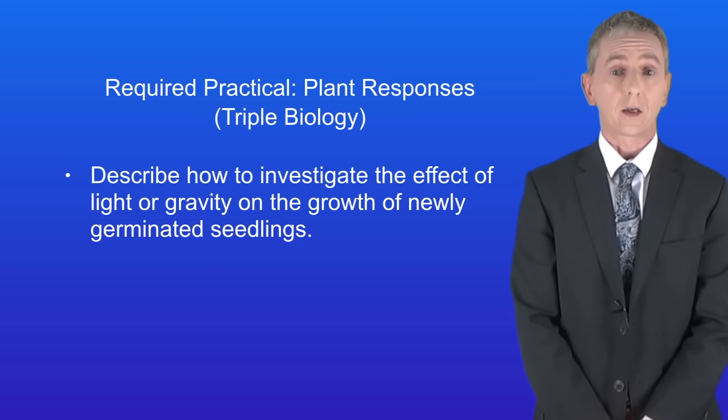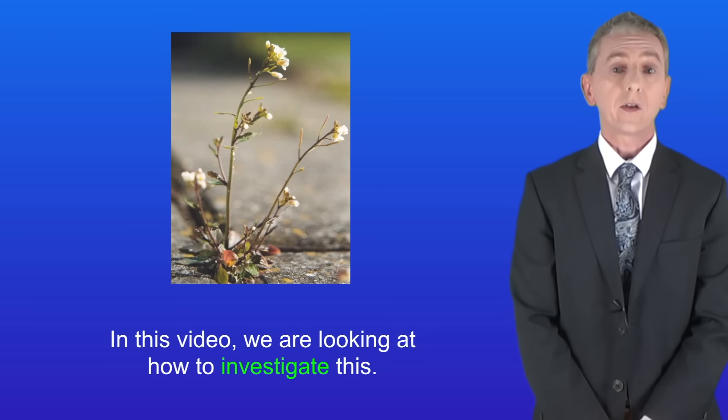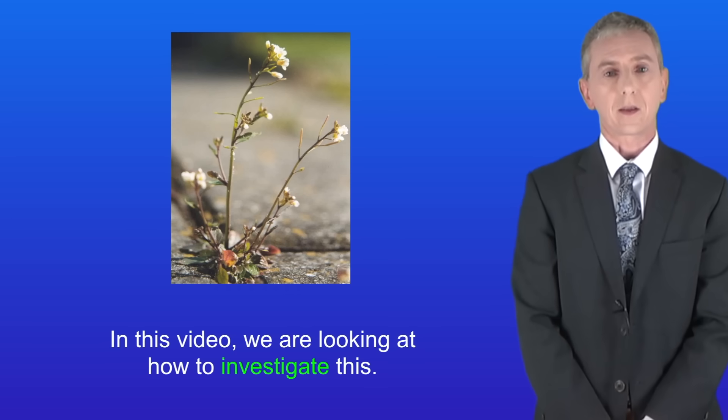Now this is a required practical so it's important that you learn the details. In the last video we looked at how plants use the hormone auxin to control their growth. In this video we're looking at how to investigate this.